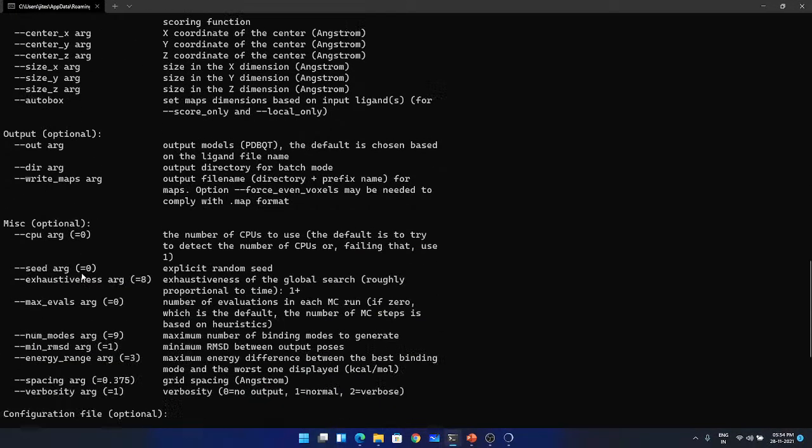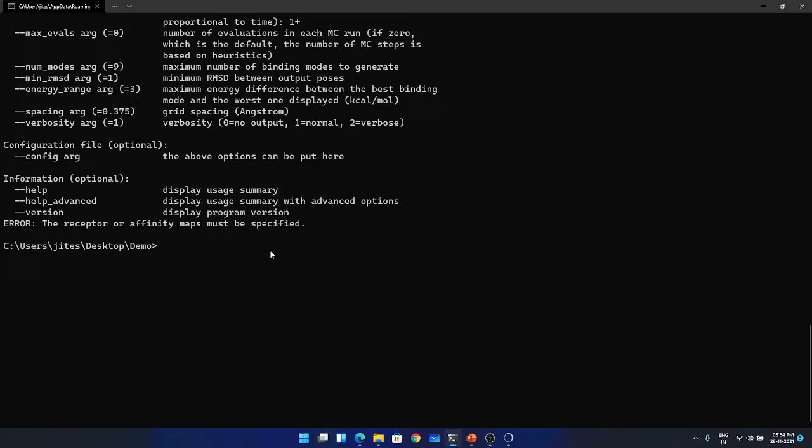As we are going to do Vina with the minimum requirements, we will build on the same thing with advanced things. So go one by one. Now we will see how to run the program. Simple. Vina 2 is our program name, so we are using it. It requires a receptor, so the receptor file name can be given here.